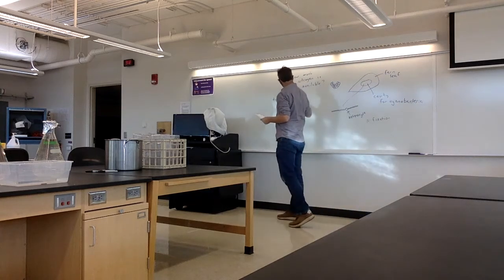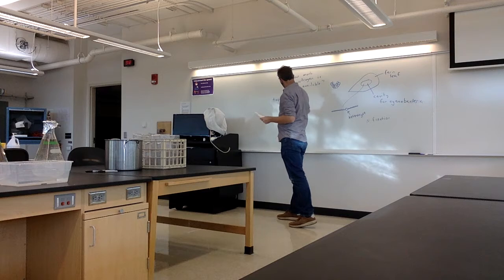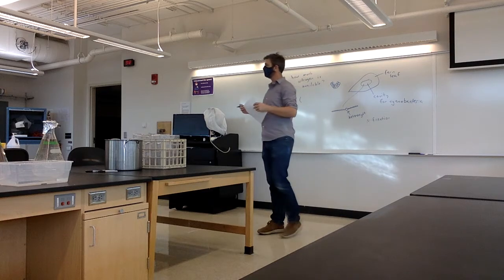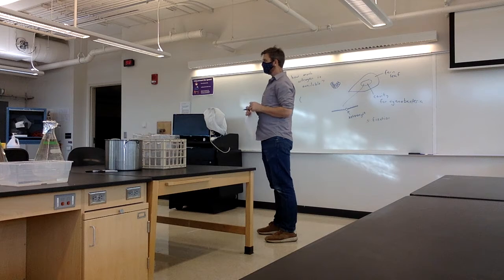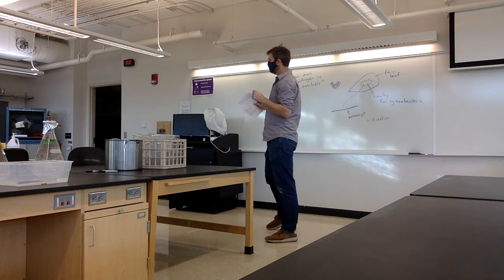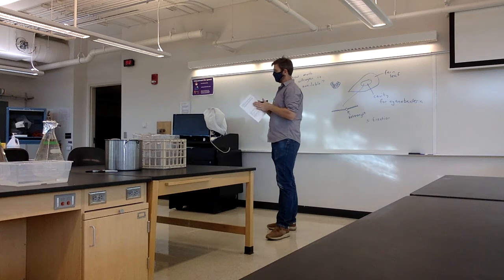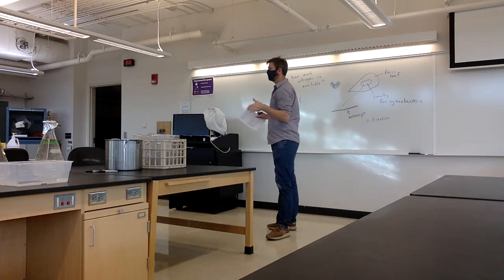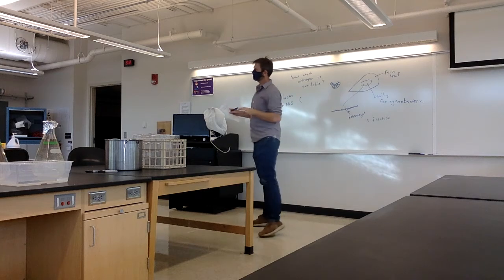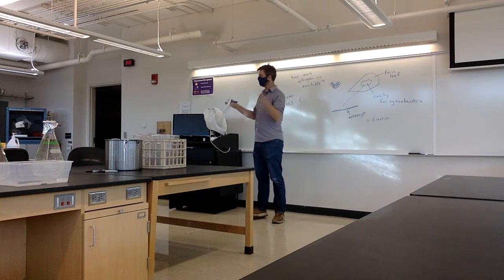So the MS is abbreviation for Murashige and Skoog, one of the older publications where people figured out, basically early on, if you wanted to grow a plant, or algae or something like that, in a chemically defined environment, we talked about that a little bit. This is basically the set of nutrients that are the minimum that plants need. Not just the minimum, but like an essential array of nutrients that a plant would grow well with.